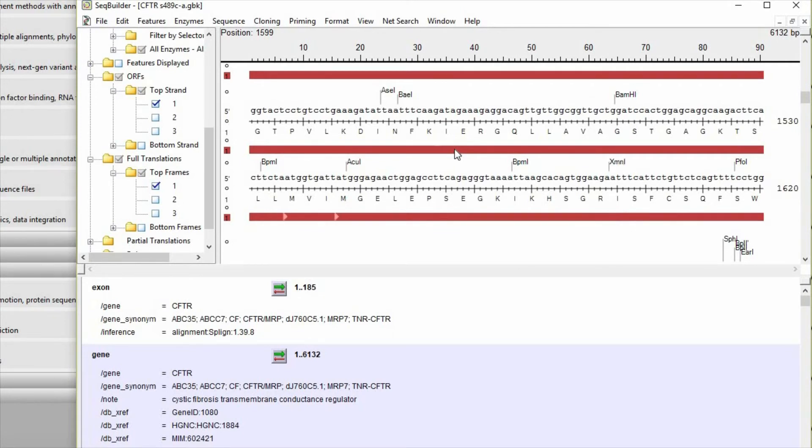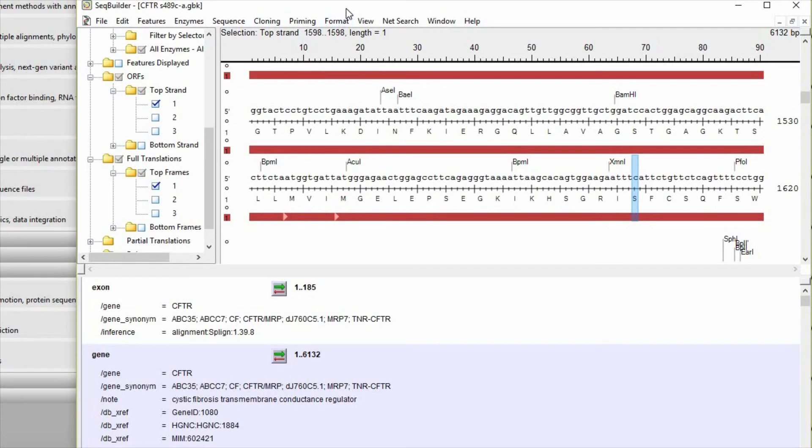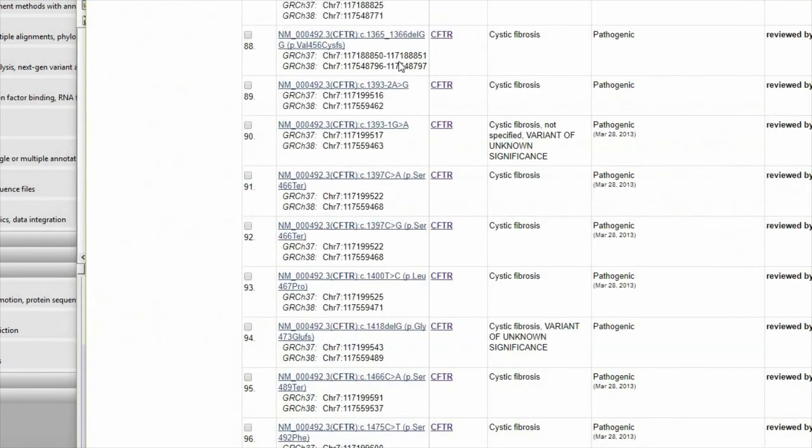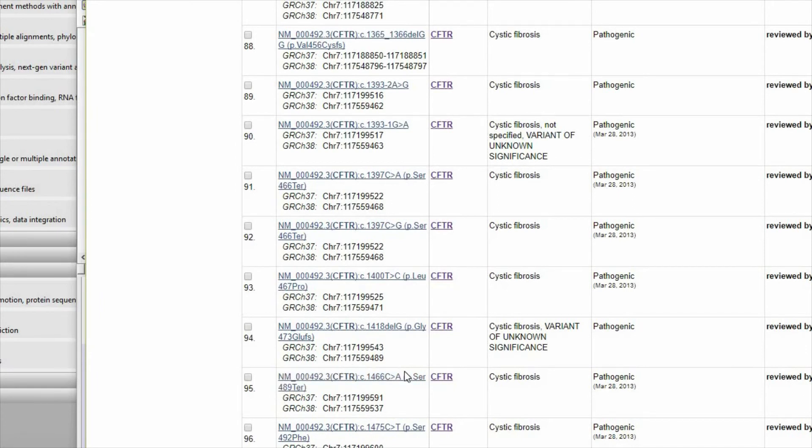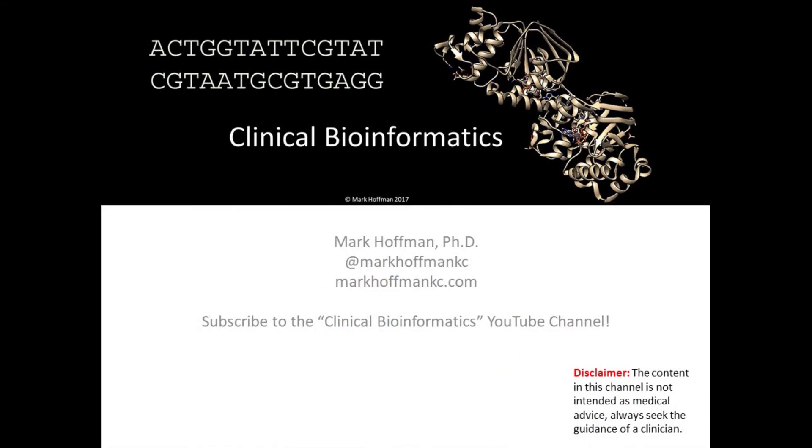The last thing I want to draw your attention to is the discrepancy in the numbering conventions. You can see that in SeqBuilder it describes the C at position 1598. But in ClinVar it says that the C is at position 1466. But remember that there's 132 nucleotides before the start codon. And when you combine those two you realize that you are indeed working with the same position.